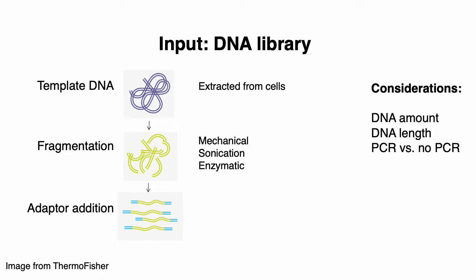Once you fragment your input DNA sequence into a bunch of fragments, you typically need to add adapters. What these adapters are exactly again depends on your technology. When we start talking about Illumina sequencing, for example, we'll talk about what exactly goes into those adapters. But generally speaking, adapters include sequences that help you, for example, do amplification, so they might contain primer sites.